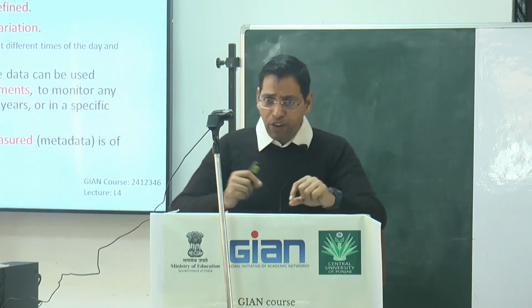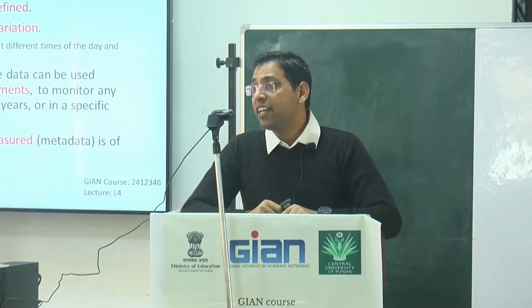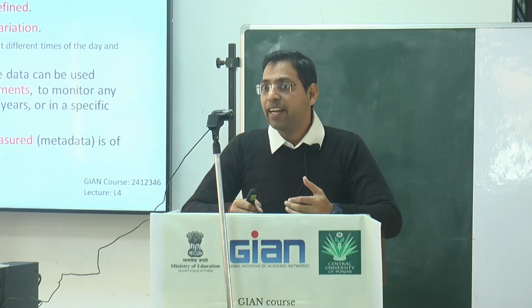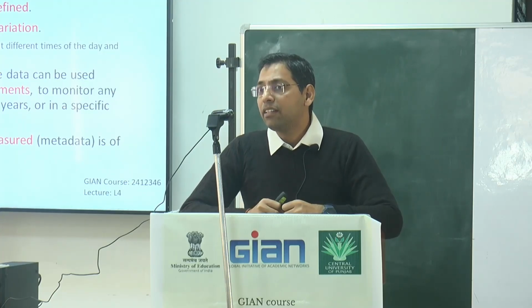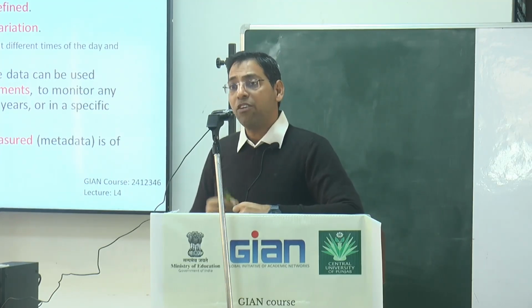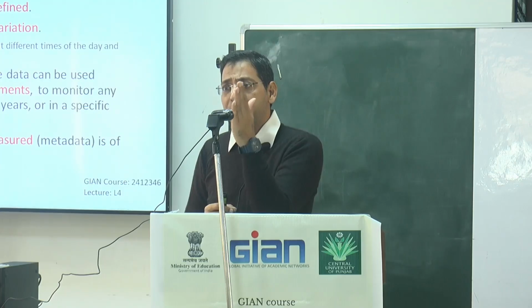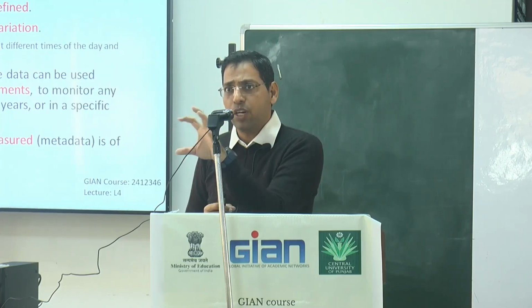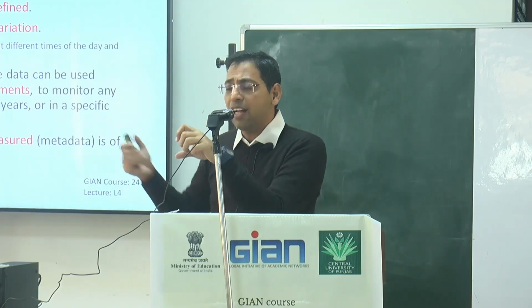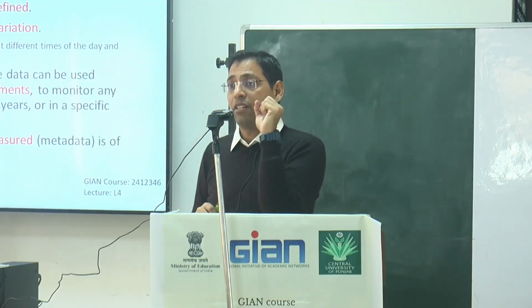So you have to fix which cultivar, what is the area from where you are collecting, what is the sunlight pattern in that area, and another point that comes here, harvesting time. At what time are you picking the sample? Because you are just differentiating your sample from another one, so you are capturing the biological variation. And these are the different parameters which influence the biological variation.